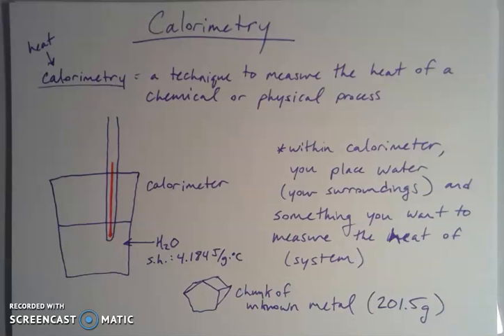Today I'm excited to talk a little bit about a technique that we use to measure the energy of chemical reactions, or to get at some of the energy or thermodynamic properties of materials, such as the heat capacity or the specific heat. One of the ways that we can do that is with a technique called calorimetry.